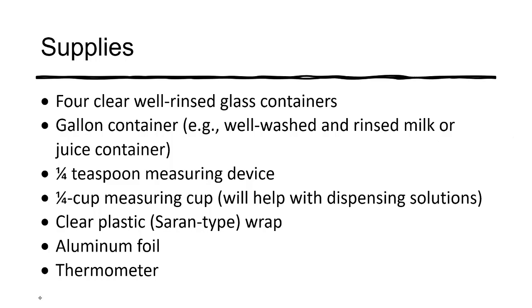You will need for this 4 clear, well-rinsed glass containers. This can just be a drinking glass. These should be at least 8 ounces because you're going to need multiple samples. You want the gallon container or a 1/2 gallon container.